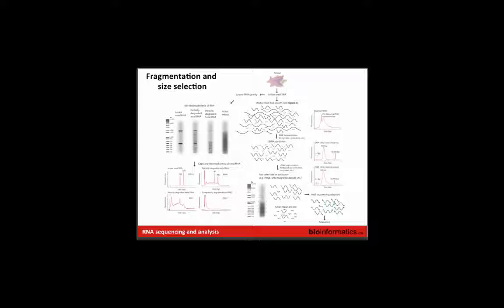And this next slide, which doesn't display very well even though that's a PDF, shows a depiction of some of these ideas. What's shown here is a gel electrophoresis of RNA, the gel version of that trace that we saw a few slides ago, where you have your two ribosomal RNA bands. It shows the idea that as degradation occurs, you get these additional bands that are smaller, and the worse the degradation gets, the smaller they get. And then when you select polyadenylated RNA from the total RNA, say from perhaps intact RNA, you get this mRNA smear that tends to look kind of like this.